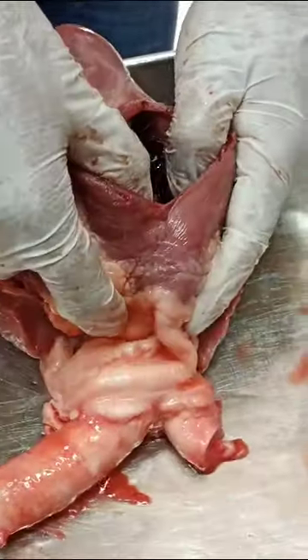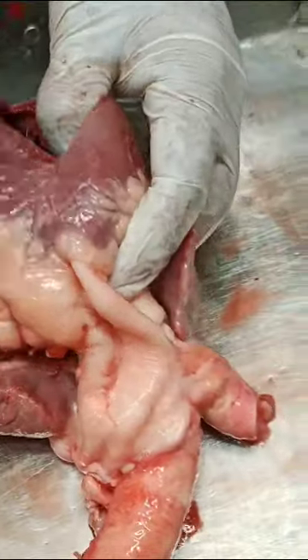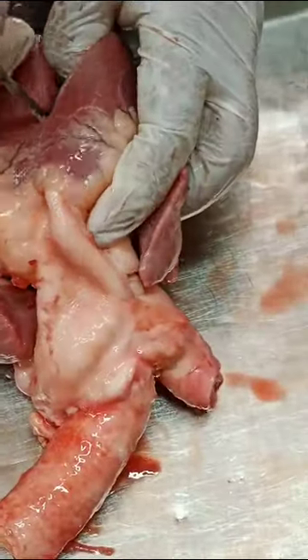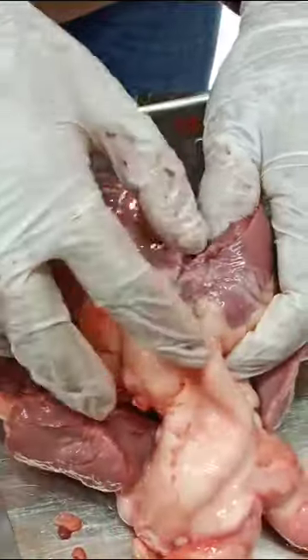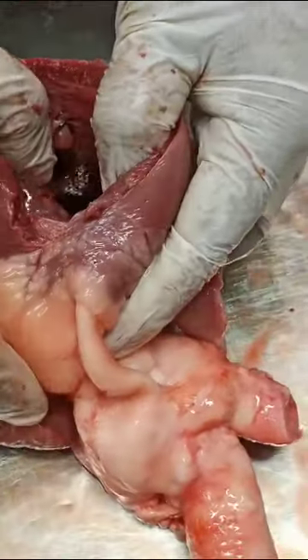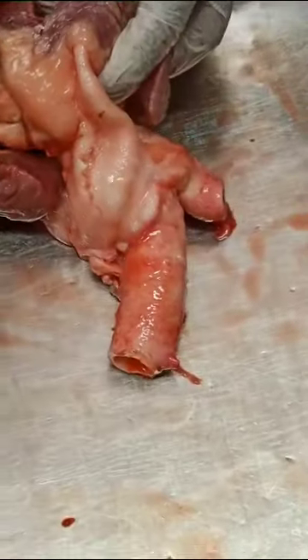Now we are going to go above it. There are clotted bloods — clots. Thick wall and thin wall. Thick wall and clotted blood. They are going to take off the blood.